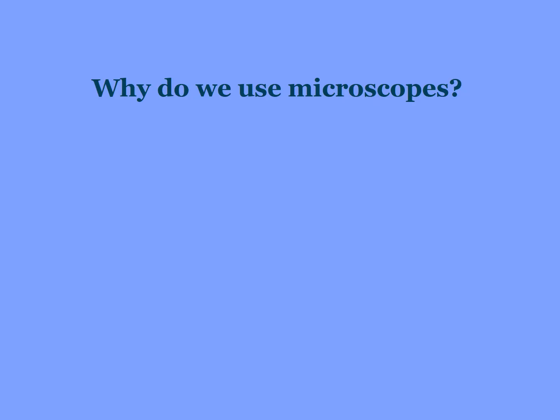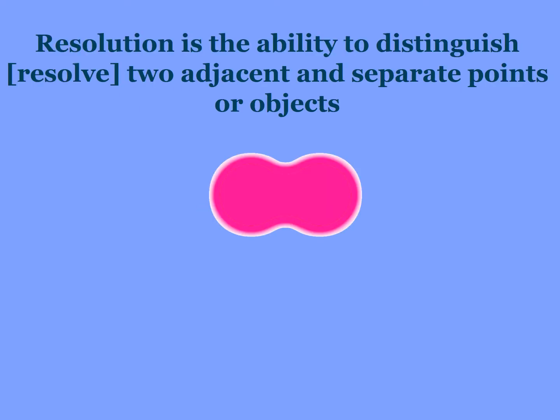Resolution. Why do we use microscopes? Well, the reason is that they give us really good resolution. But what is resolution? Resolution is the ability to distinguish between two adjacent and separate points or objects.